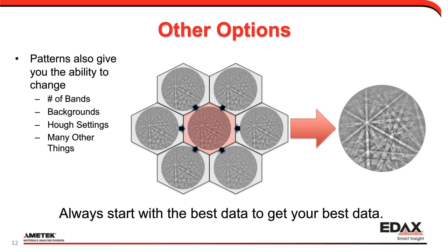It's really what we're pushing into here: those more difficult and harder samples. Those geologics, those hard ceramics. I've been doing things like graphite and very, very low C materials where I just get perfect data because I have these tools available to me.